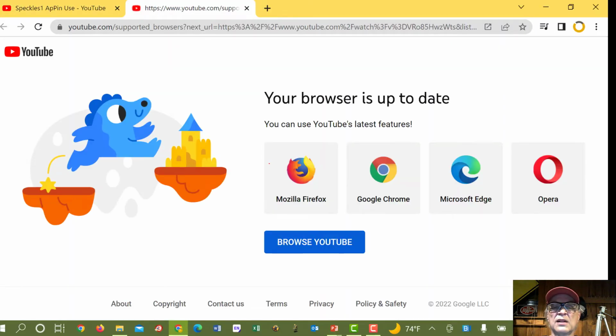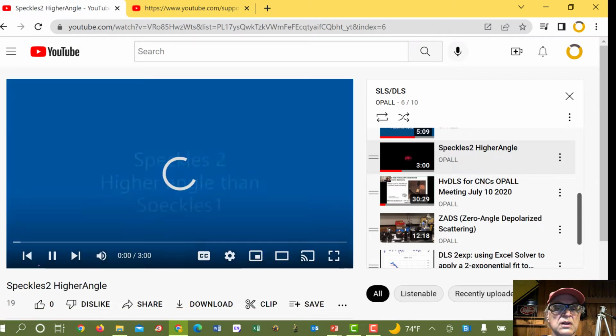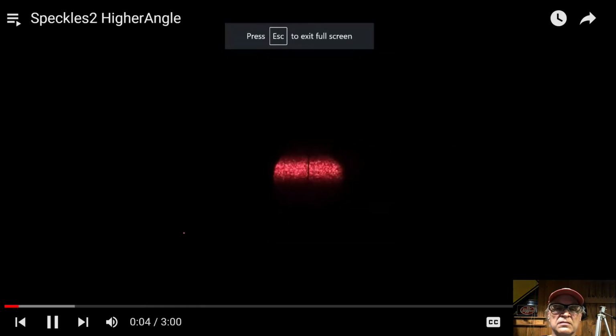Oh, yeah? Great. I guess those videos aren't working as well. The links aren't working like I wanted. Okay, so this is the same 500 nanometer latex sample. We've now moved to 40 degrees scattering angle. This is with open pinhole settings. I had to change my original plan, and different light intensities than previously.